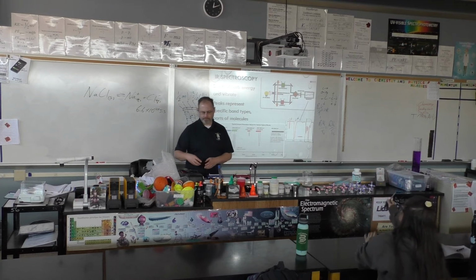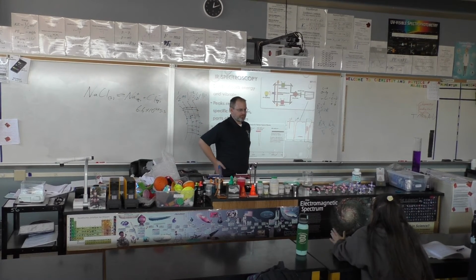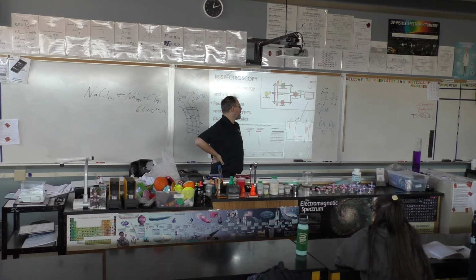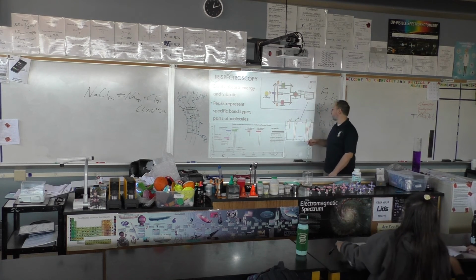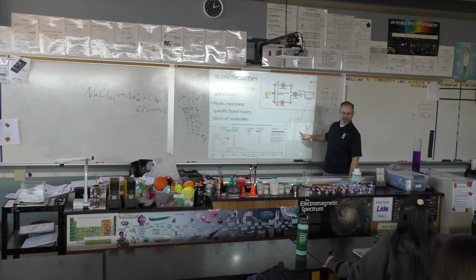Yes. Sure. But if you have the CH and OH bonds, how do you then determine from that what it is exactly? You have to do more tests? Yes, but having the parts there is important. And the intensity is also important. So when you start to actually do it more and more, you'll start saying, all right, I got a very pronounced OH, but nothing here.